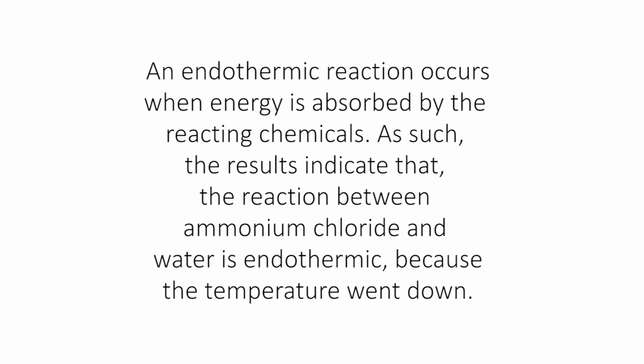An endothermic reaction occurs when energy is absorbed by the reacting chemicals. As such, the results indicate that the reaction between ammonium chloride and water is endothermic because the temperature went down.